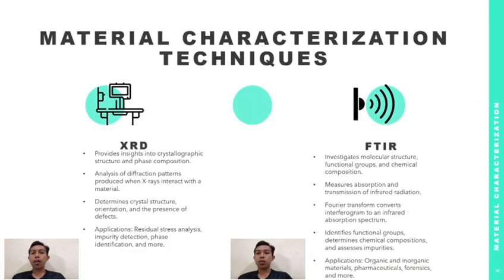One powerful technique used for material characterization is X-ray diffraction, or XRD. XRD provides valuable information about the crystallographic structure and phase composition of materials. By analyzing the diffraction pattern produced when X-rays interact with a material, researchers can determine its crystal structure, crystallographic orientation, and the presence of crystal defects.